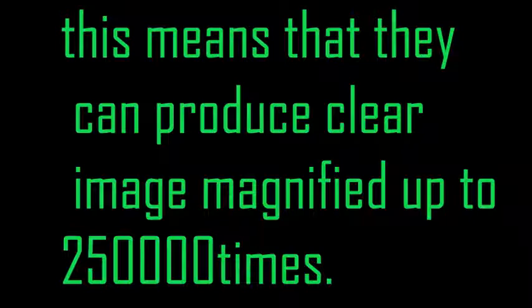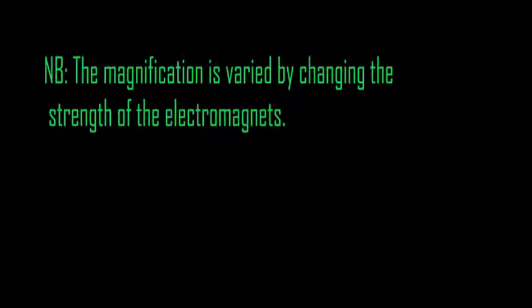Notice, the magnification is varied by changing the strength of the electromagnets.